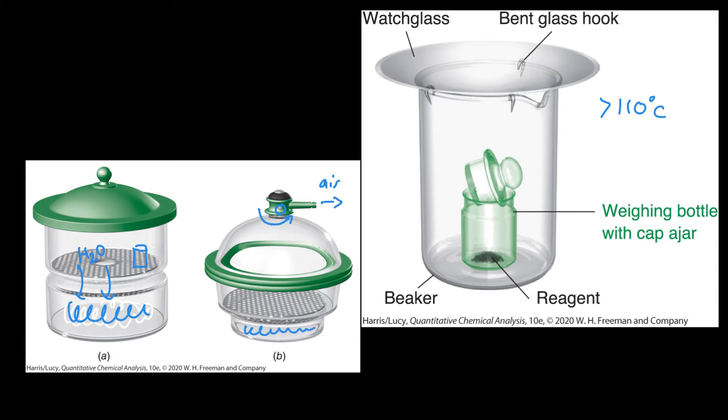That helps to pull water from our sample. Again, we've got desiccant in the bottom to absorb and irreversibly bind with any of the water that comes off. The only problem with a vacuum desiccator is that when we open it up, we can't open it without releasing the vacuum. We basically turn this top valve in the opposite direction and air will rush in.